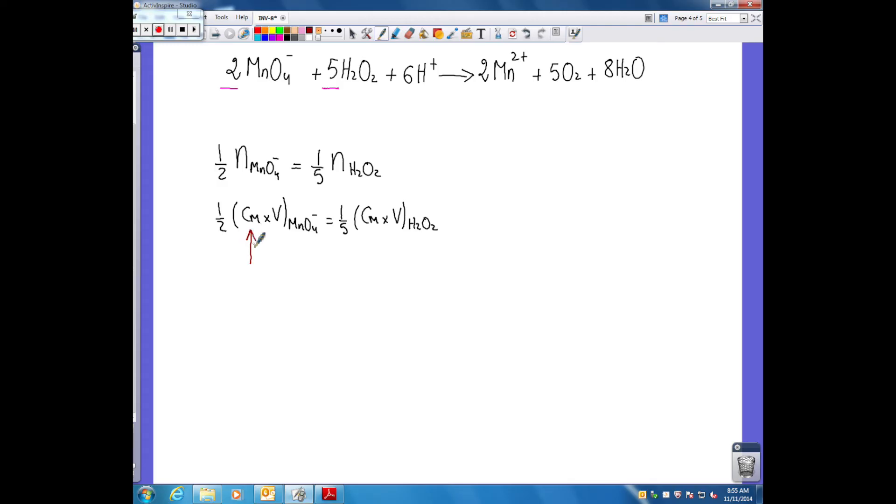The molarity of MnO4- is known, it's 0.06 molar. The volume of MnO4- is determined by titration. That's the volume I can read on the burette.